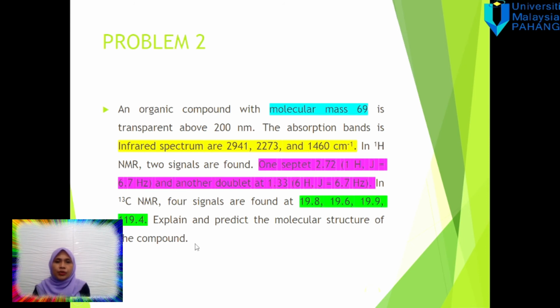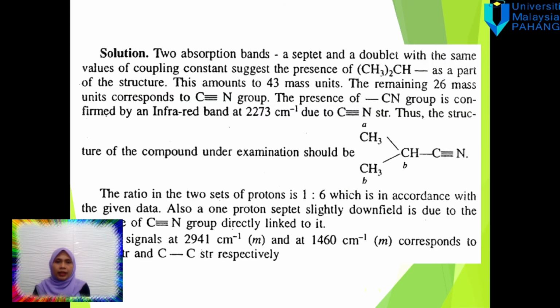We can choose to answer in the form of text or a table like the previous example. I will show you how to solve the problem with a text answer. This is based on the FTIR data and the mass data.